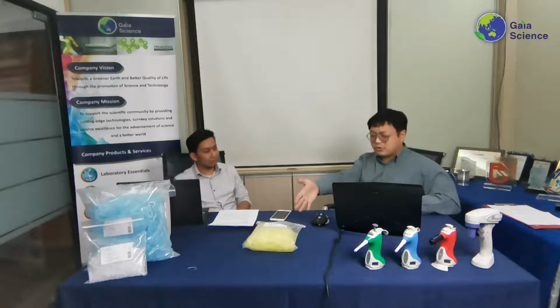And it really comes down to your use case, actually. Now I'll put it this way. Unlike the very typical general tips out there, normally those low retention ones can retain less liquid. So you can also get more accurate, consistent results as you aspirate and dispense many times.